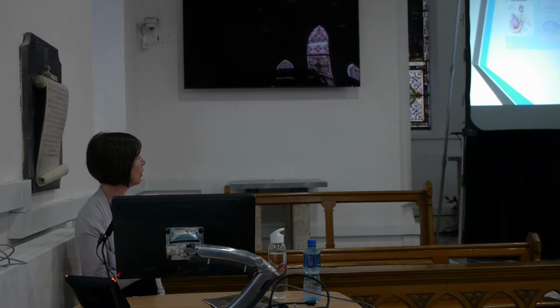So we think that Raman spectroscopy fits the bill here. We think that Raman spectroscopy, in its ability to molecularly fingerprint a sample, could be used in cervical cancer. So this is what our workflow looks like.